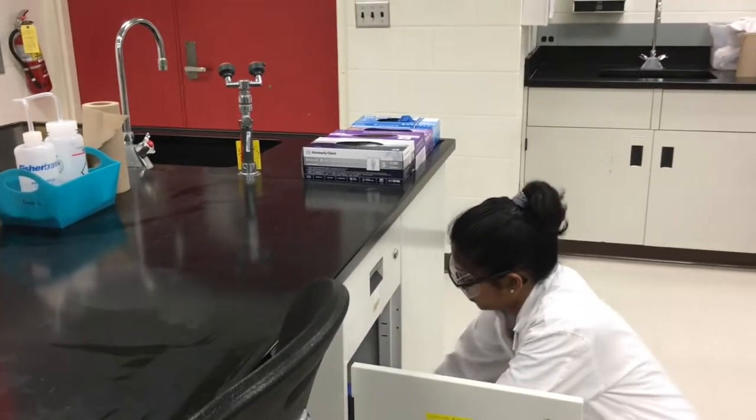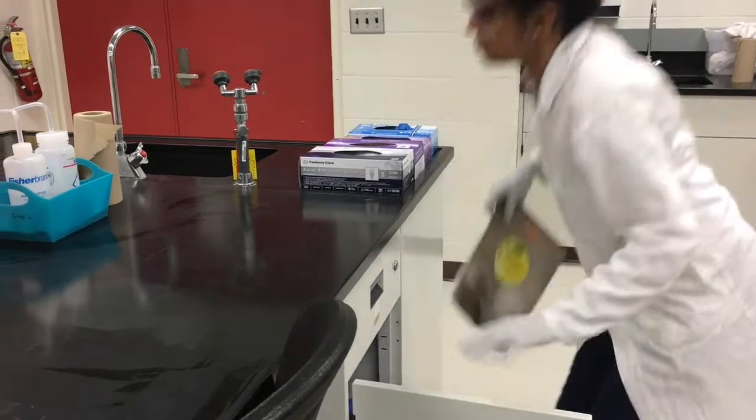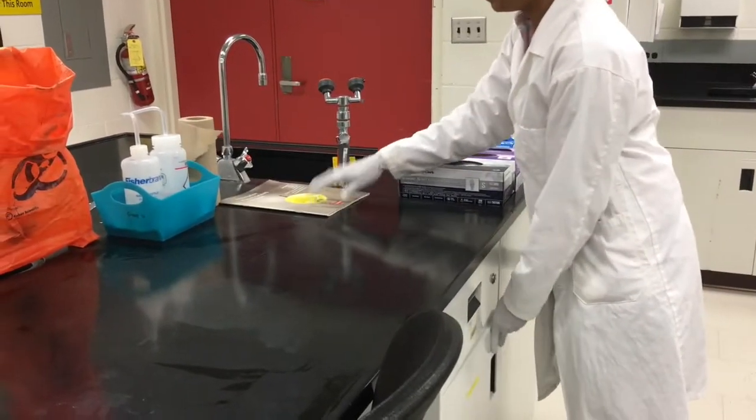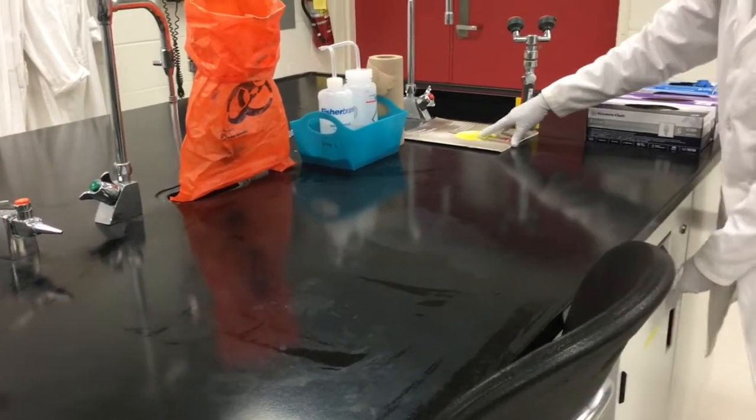This area is where you will be working with various microorganisms and is to be kept clear of papers and personal items. Keep your lab manual or current protocol to either side of this workspace.